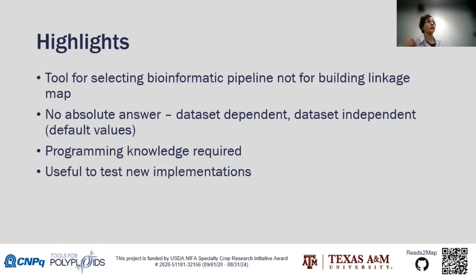And you only need to know WDL if you want to implement new features, if you want to implement new software. I think Reads2Map can also be useful to developers that want to test new features or want to test if the software is still doing what it's supposed to do after a change, because I just change the version of the image with that software and it can rerun the data set. So I think it can be useful too.